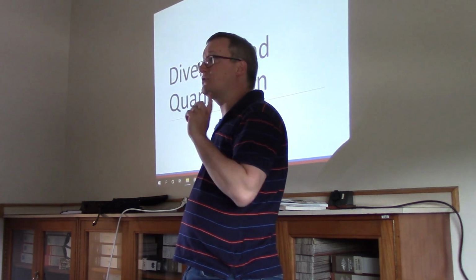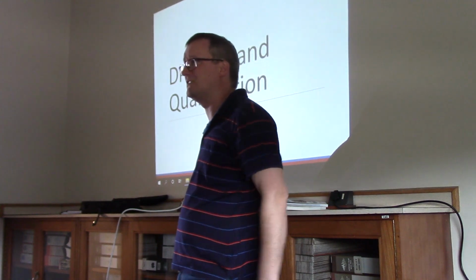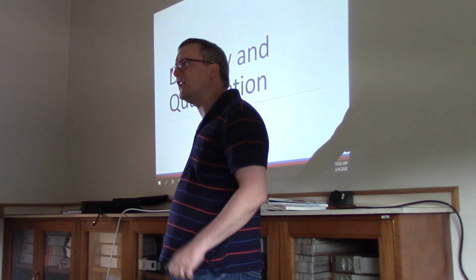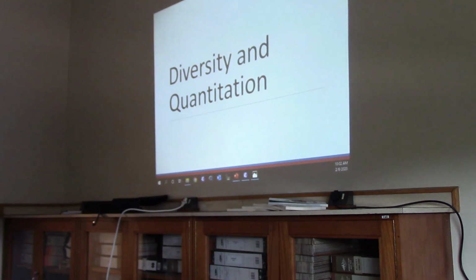In any case, you should never expect that every consensus sequence will be unambiguously resolved down to a particular species. This is just not going to happen. So we have a lot of unknowns left to us in the microbiome space. That said, let's talk a little bit about diversity.